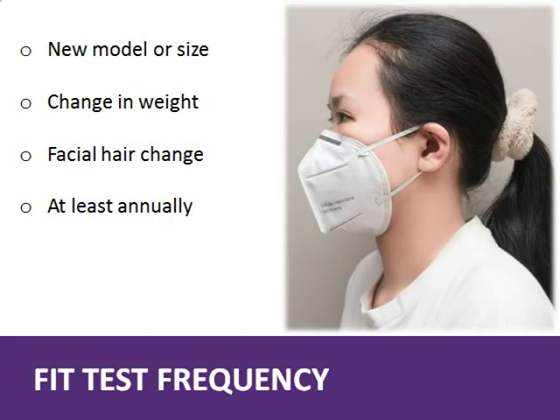Because each brand, model, and size of the facepiece N95 respirator will fit slightly differently, a user should engage in a formal fit test every time a new model, manufacturer type or brand, or size is worn. Also, if the user's weight goes up or down significantly, a fit test should be done again to ensure the respirator remains effective. If there is a change in facial hair, a fit test may be required. Otherwise, fit testing should be completed at least annually to ensure continued adequate fit.